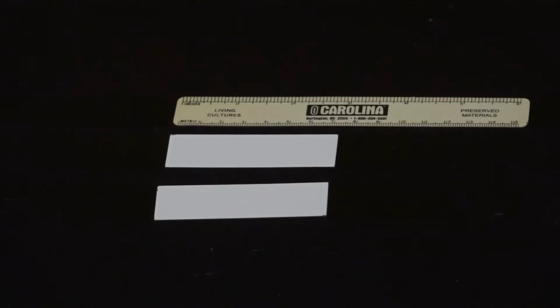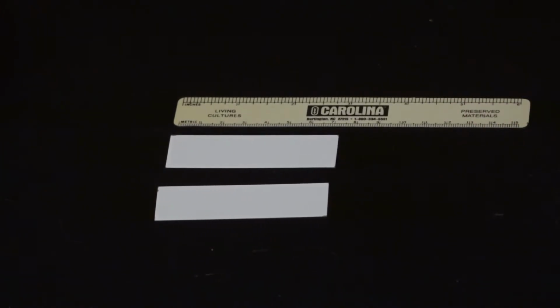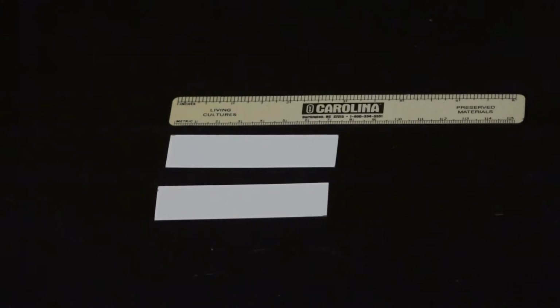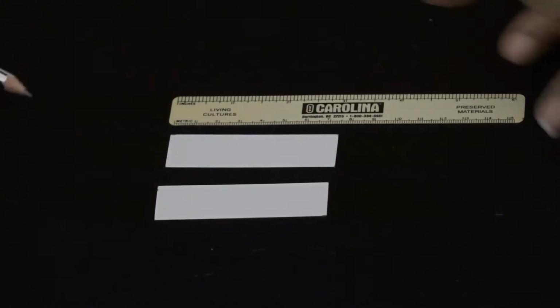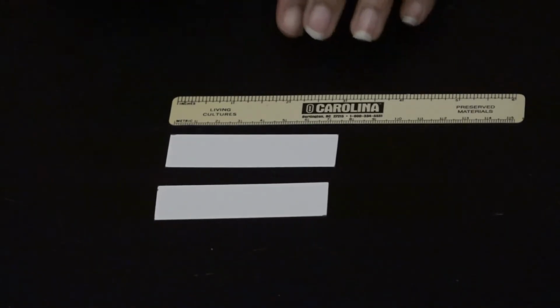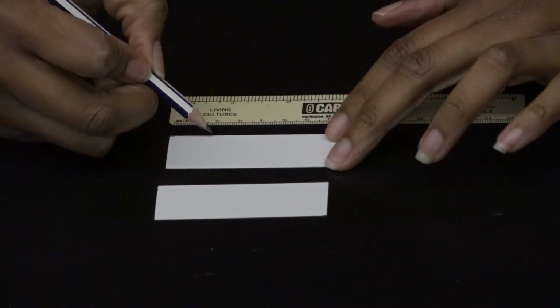Cool. Okay, so here are our chromatography strips. I have 2 for good measure. It's always good to have replicates when you're doing an experiment. And I have a ruler here because I want to put my dots about 3/4 of an inch away from the bottom of the chromatography strip. So here's our inch mark. So 3/4 is about here. That seems really high up, honestly, but this is where we'll start.